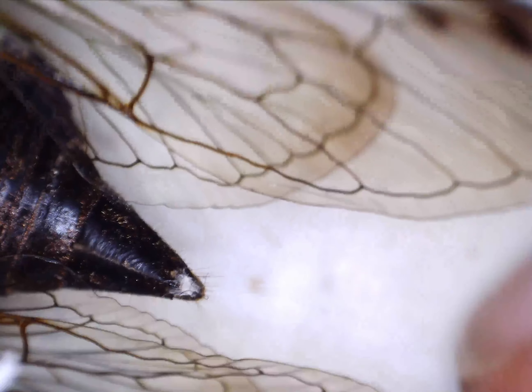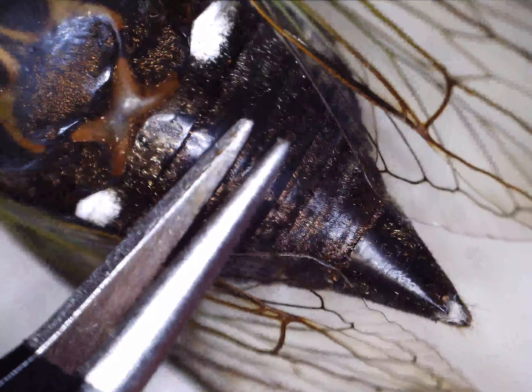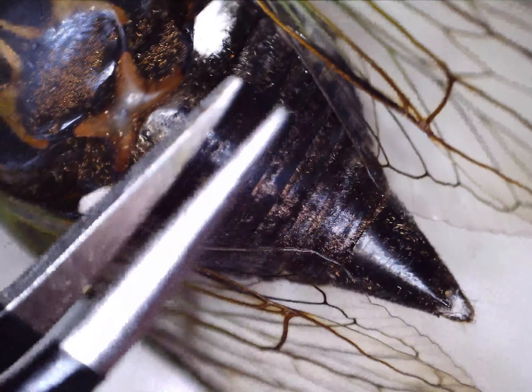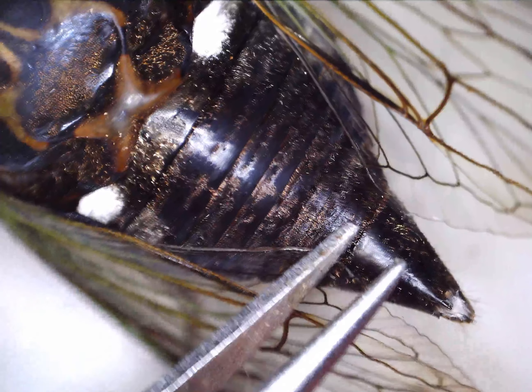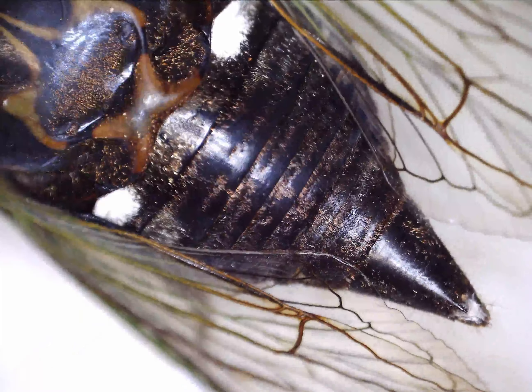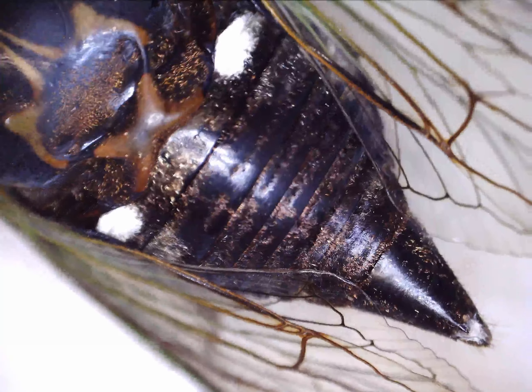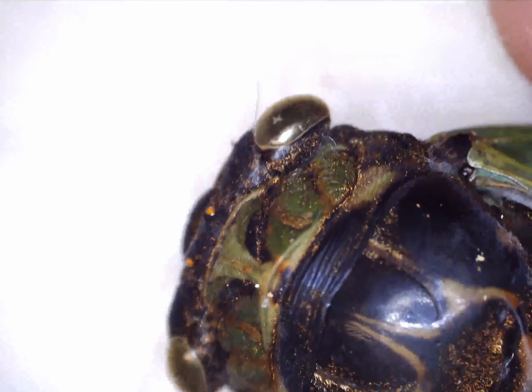They make their sound by vibrating these plates right here together, and that's how they find a mate or a girlfriend. The ones who are usually making the noise are the males, and I'm sure any woman will agree that males are the noisy ones — you will not hear any arguments from that.